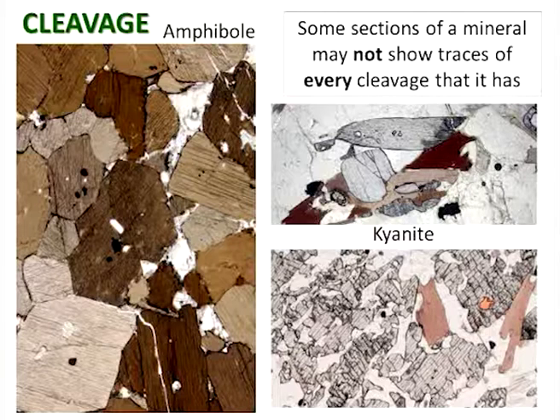Those look less well defined, and the reason for that is that cleavage in kyanite is not as perfect as the other set of cleavage planes. That's quite common as well: if you have 2 sets of cleavage, they're not necessarily always going to be perfect. One is very often slightly better than the other.